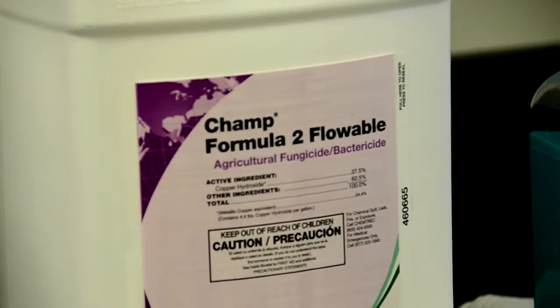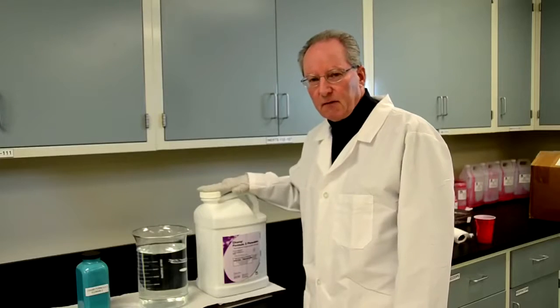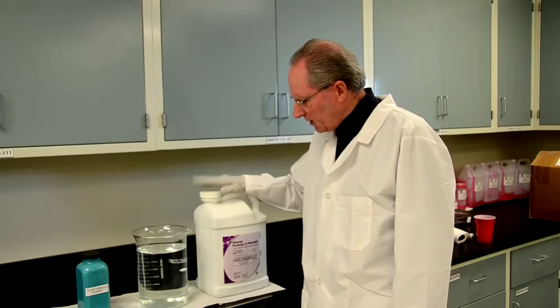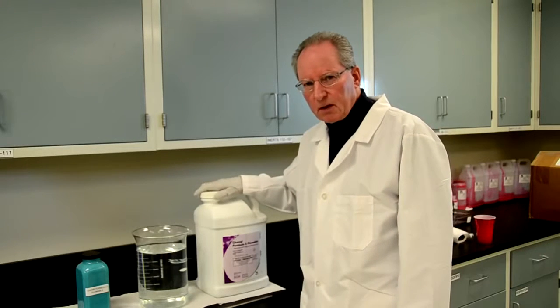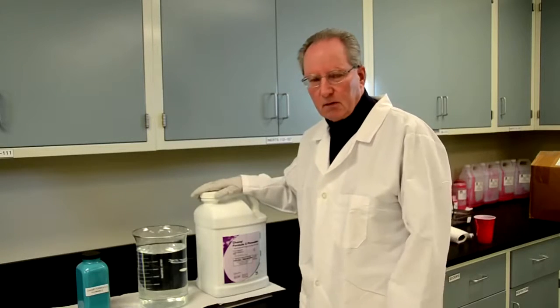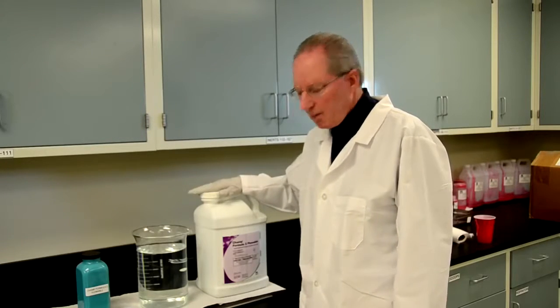We've improved this formulation to basically have no settling over at least a three-year period and this product disperses quickly into water and flows easily through a sieve, and I'll demonstrate these properties to you.